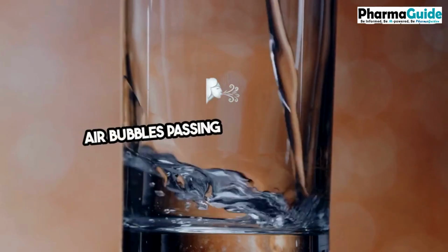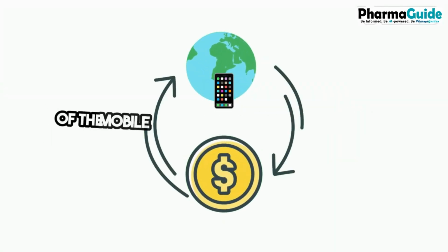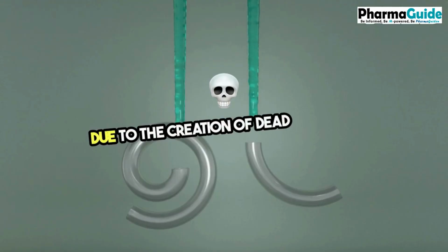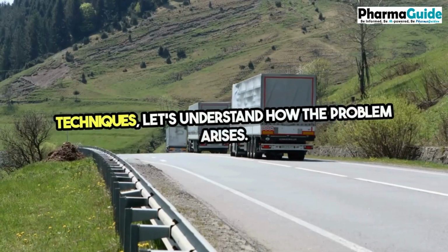Air bubbles passing through detectors lead to spurious peaks. Air bubbles can contribute to the flow transfer of the mobile phase through the HPLC column due to the creation of dead volumes. Before a discussion on the features of degassing techniques, let's understand how the problem arises.